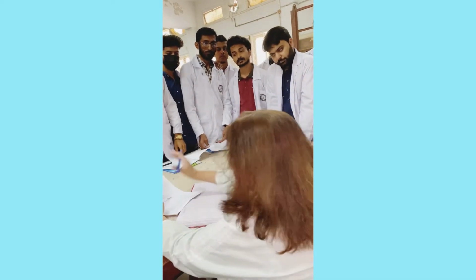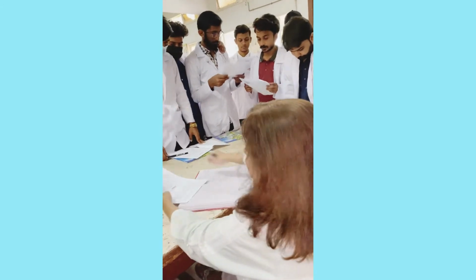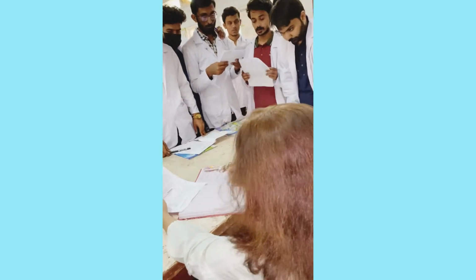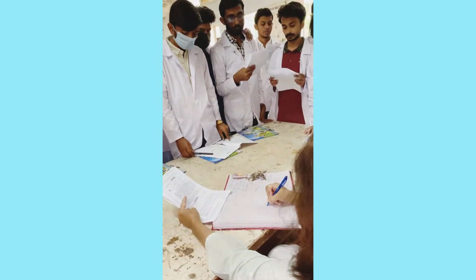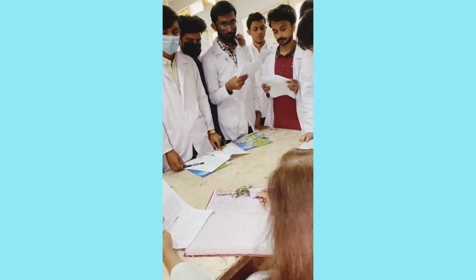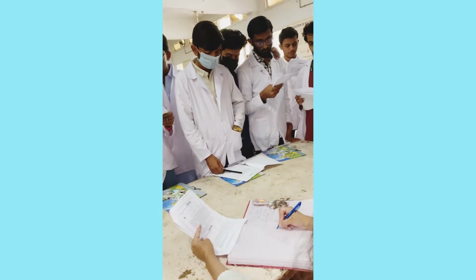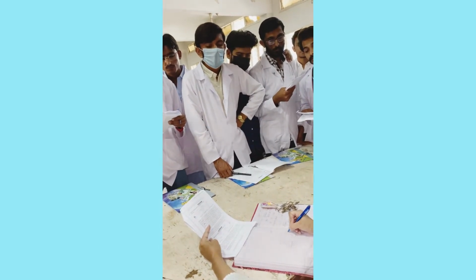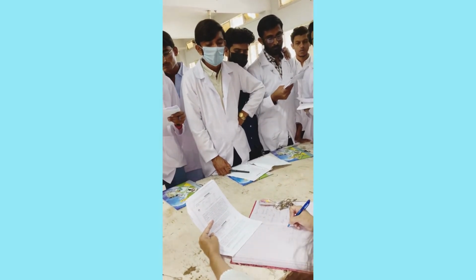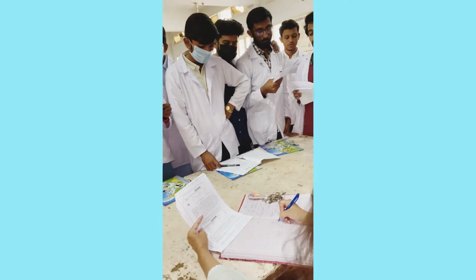Now what is happening in the reaction? 0.5 gram, read your scheme. 0.5 gram of acetanilide. That means you will weigh 0.5 gram in a conical flask, right? Add 1 ml glacial acetic acid and 1 ml sulfuric acid. That means in a measuring cylinder, you are going to add 1 ml of acetic acid and 1 ml of sulfuric acid.